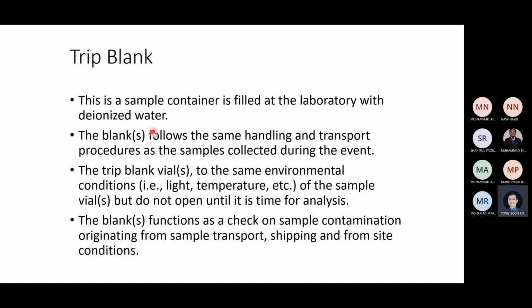So why are they important? Okay, I start off with trip blank. So what is that? It is a sample container that is filled in the laboratory with deionized water. Before you go for the field trip, you fill the same container you're going to use at the field with deionized water. And then you bring this whole container to the site and handle it.